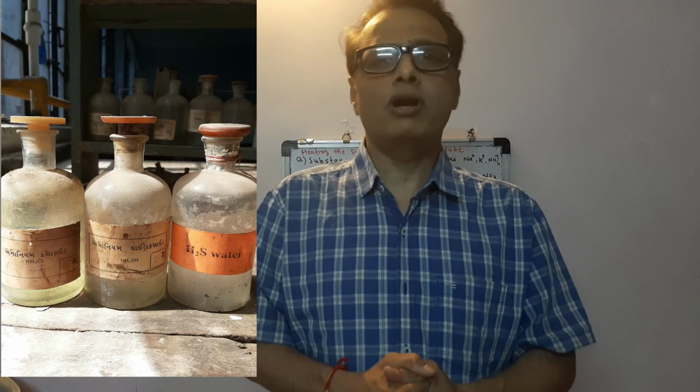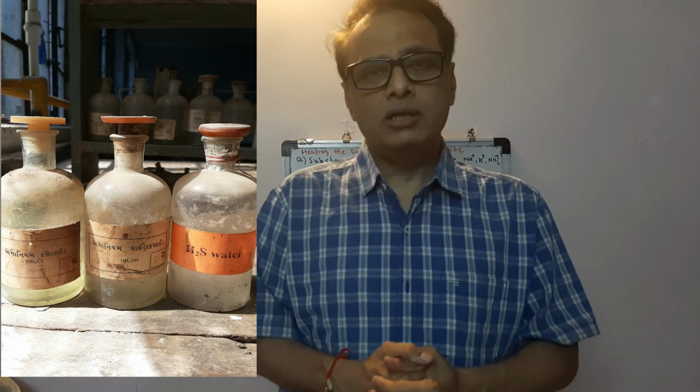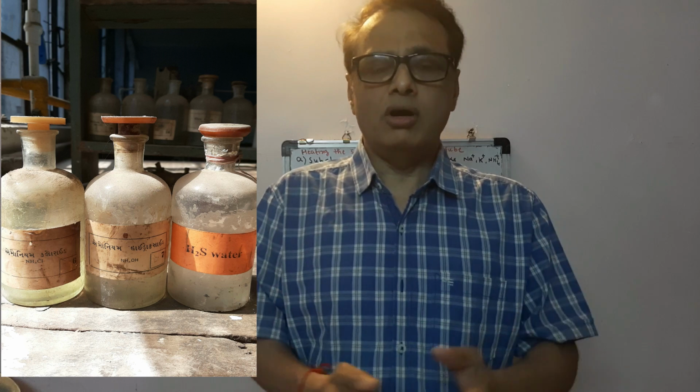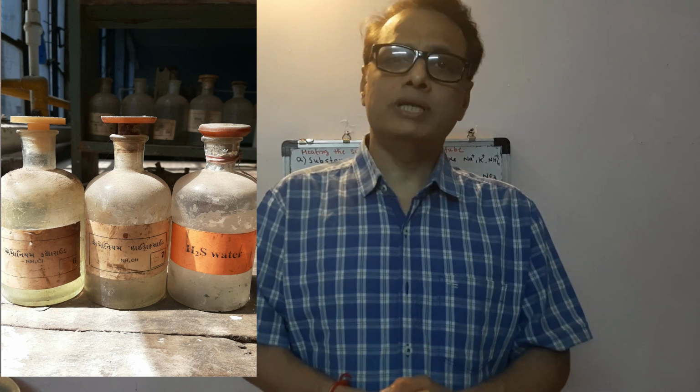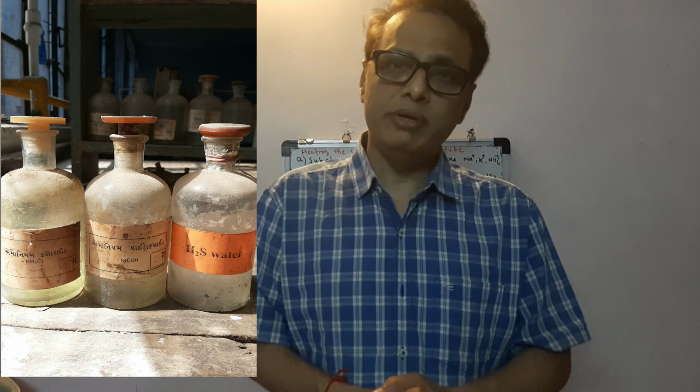Suppose if we don't get precipitates in the third group, then simply we have to add hydrogen sulfide water or hydrogen sulfide gas into the above solution, because ammonium chloride, ammonium hydroxide and hydrogen sulfide are the reagent for the third B group.